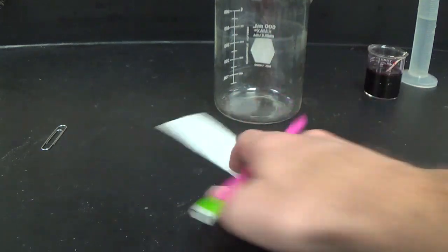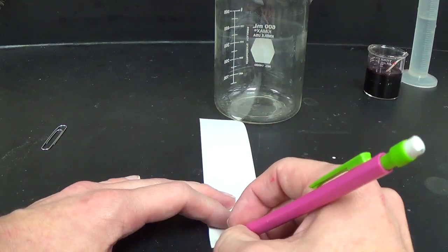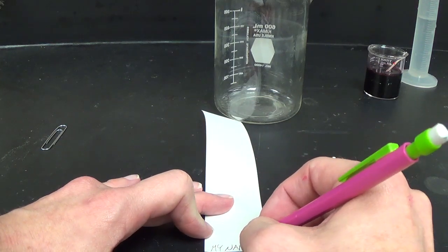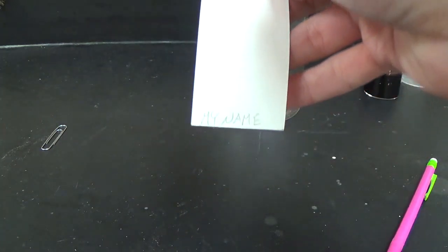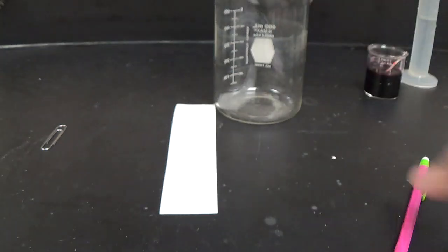Now, also on the other side, so I put pencil mark there, on this side is my name. Okay, so I wrote my name on this side. Get it? It says my name. Okay, literally. So I've got my name on this side. There it is. And I've got the pencil mark on this side as a starting mark. And I'm going to now place my sample mixture on my starting mark.